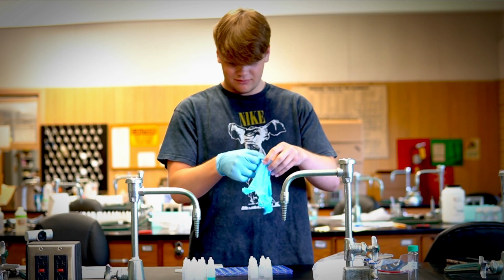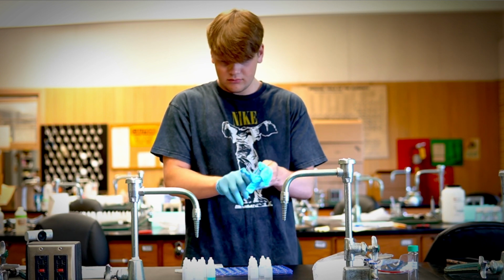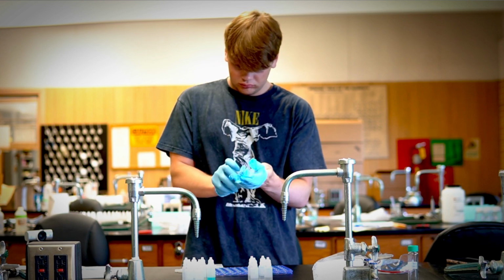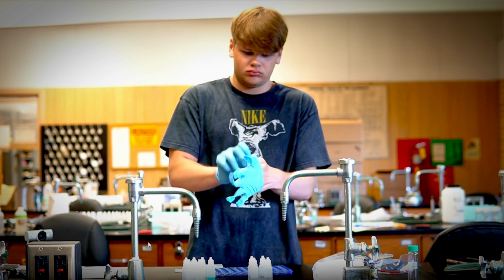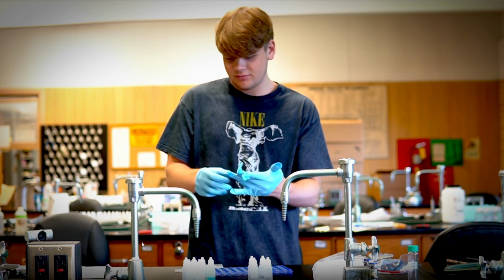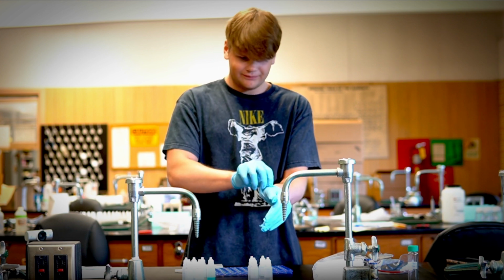You should have gotten gloves in your kit, but if they don't fit you, make sure that you get some gloves from Walmart or any other store. Some normal nitrile gloves should work. And after putting on your gloves, you should put on your goggles. You should also have some goggles in your chemistry lab kit.